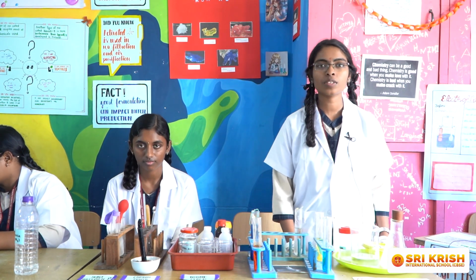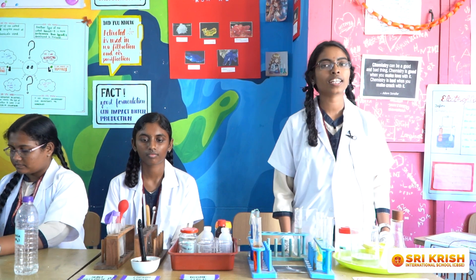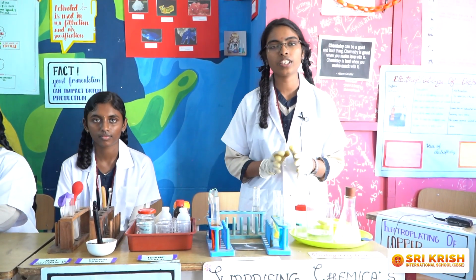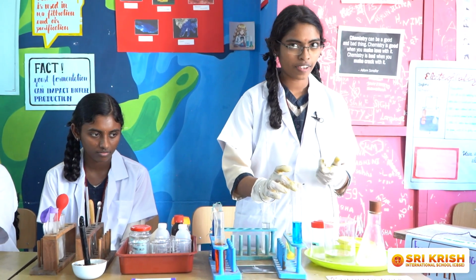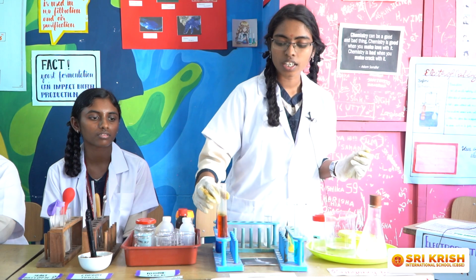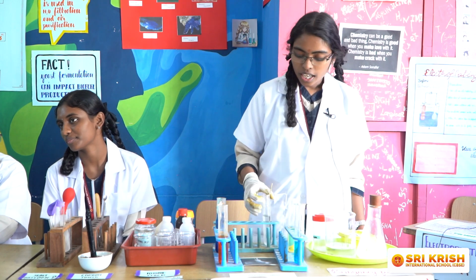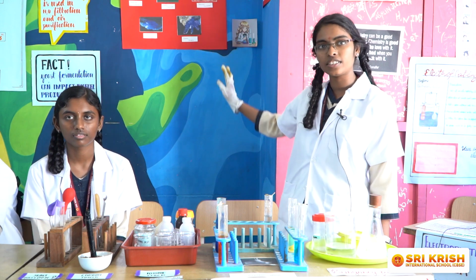Crystallization is a process by which metal salts will arrange themselves into geometric patterns called crystals. These crystals will be made in a maximum of 20 days. But here I have shown some samples with 2 days of formation. These samples are copper sulfate, and this is copper nitrate. These are potassium dichromate and potassium ferricyanide. This is magnesium sulfate. After 20 days, we will be getting these crystals.